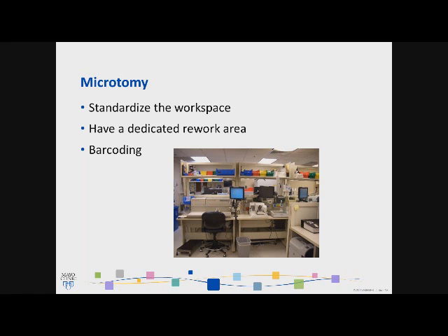Barcoding has drastically improved any of our mis-IDs. However, we have found that we've had a couple. So we try to go back and work with the technician, not necessarily to place blame if there is a mis-ID, but really to rework the steps and determine why this occurred to prevent this from happening again. Again, it's important to learn the process, not to place blame.